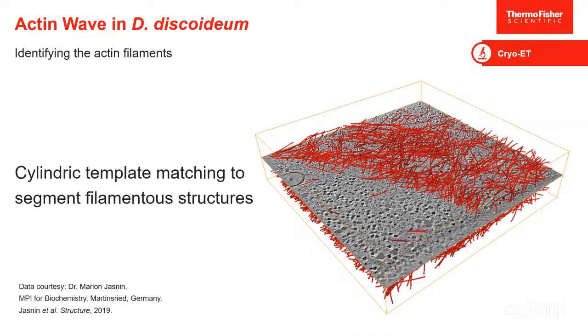If you're talking more about the intracellular structures, like maybe the actin filaments of them, that will be a little bit more challenging until you can make out the resolution of those filaments, because what we'll need to do is actually segment individual filaments. So if you cannot make out the individual filaments with the resolution you're acquiring, you'll be hard pressed to quantify the directionality of those.